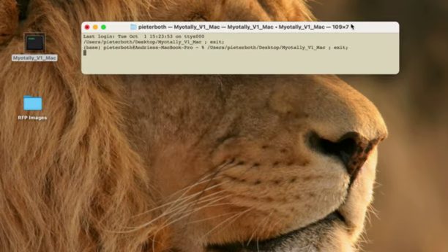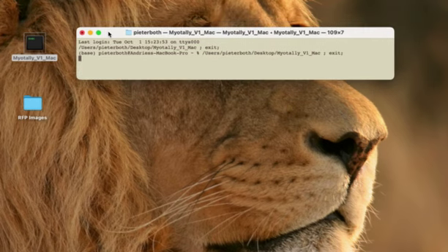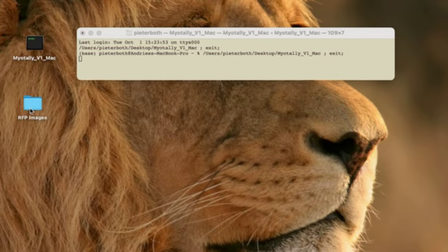Nothing needs to be done with this window. It can just be used to monitor the progress of your quantification once we initiate the quantification. If at any point you want to terminate the application, just exit out of this window and the software will close. So after you click to open Myotally, it will take another 1 or 2 minutes or so before the user interface shows up. So in that time, let's talk about proper folder structuring and image naming.